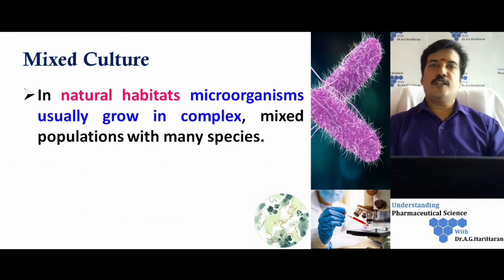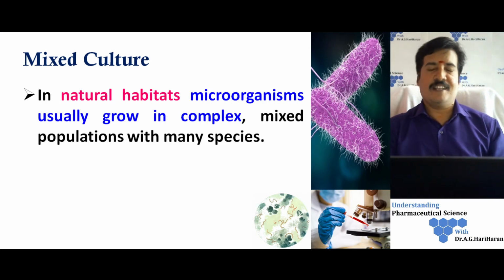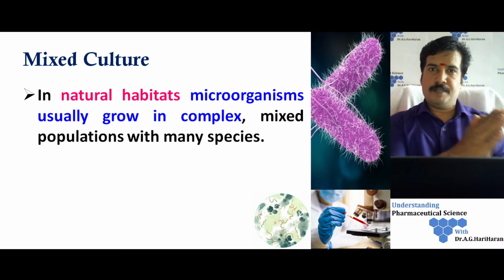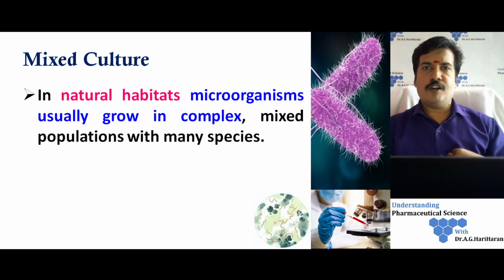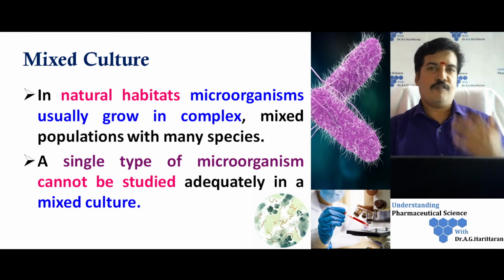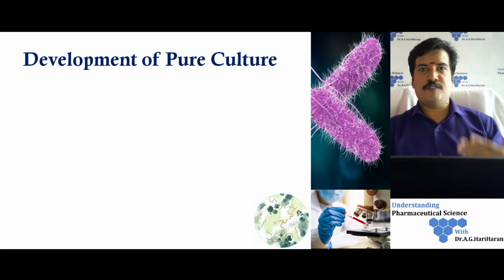Naturally, microorganisms grow in a complex environment as a mixed culture. That means different species of bacteria and different species of fungi will be seen in a mixed form in this natural habitat. If you want to study a particular type of microorganism, it is not easily done through a mixed culture stage. First we have to isolate it into a pure culture form, and only then can we characterize or study that particular species of microorganism. So there is a need for the development of pure culture.